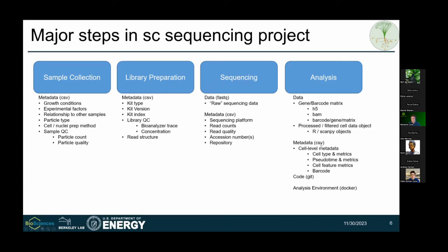And then the metadata associated with these matrices includes everything that you've inferred from your cells. This is probably one of the most exciting aspects of your analysis. All that hard work that you did to analyze cluster by cluster, with validation. It's really important to make this data available so that others can use it.